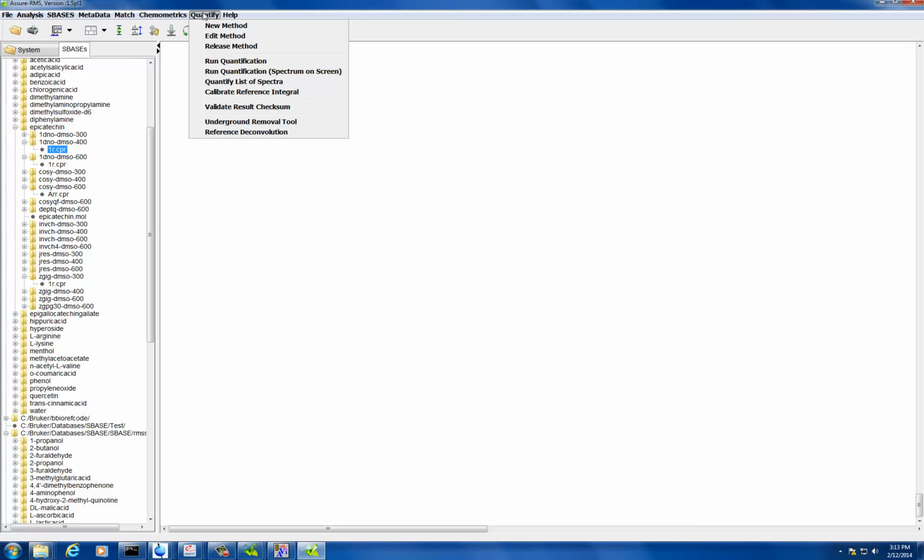That's the hard part, because we usually ask to do all the line shape and sensitivity tests every day, or every week at least once, so it maintains the instrument, and then you really don't need to run that. But from the fact that you guys don't do any of this sort of optimization of the instrument just to make sure that it's okay, I might say run it. And it depends because everyone uses it all the time, but I would say maybe once every time you run your experiment.